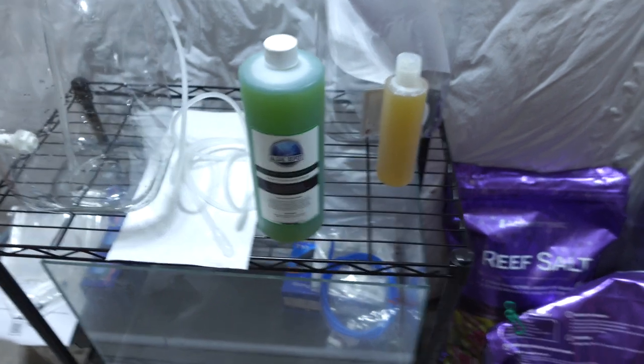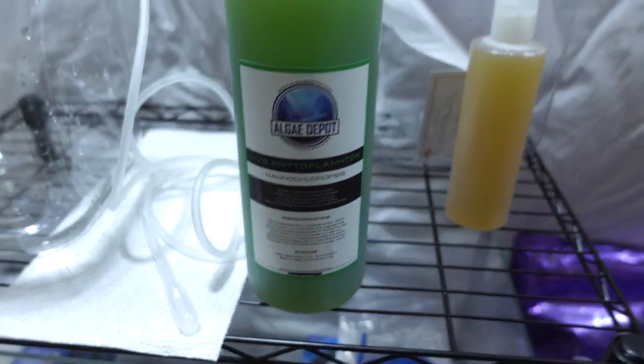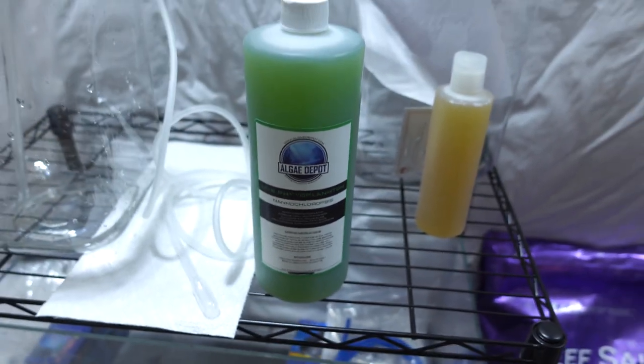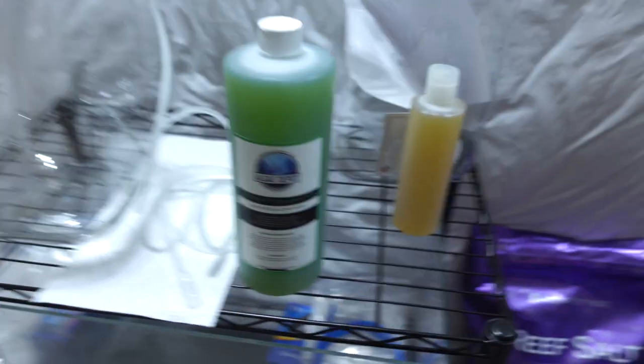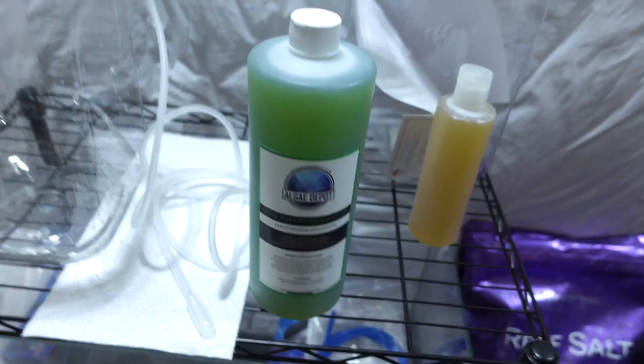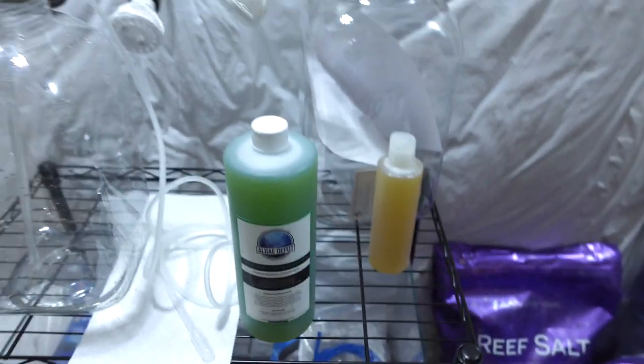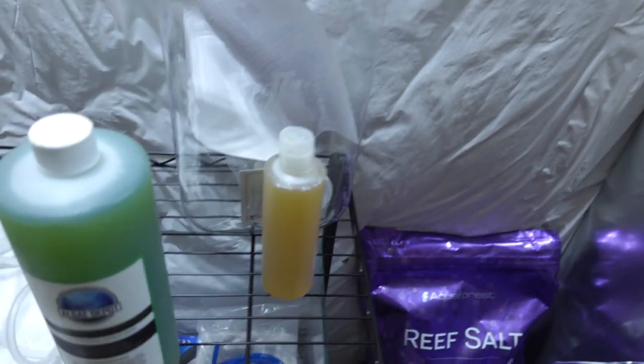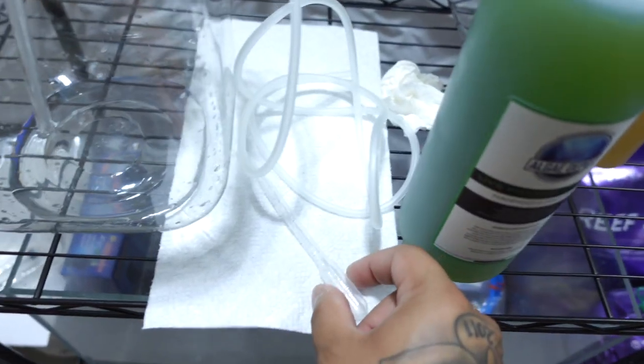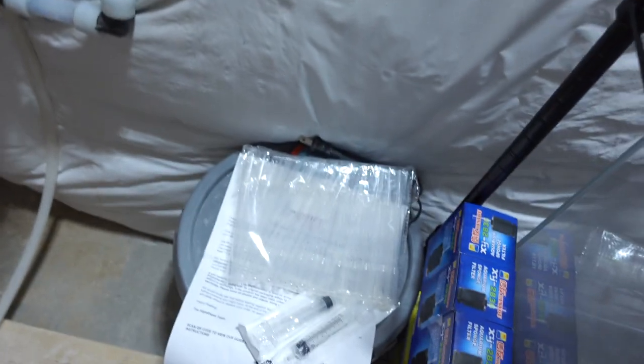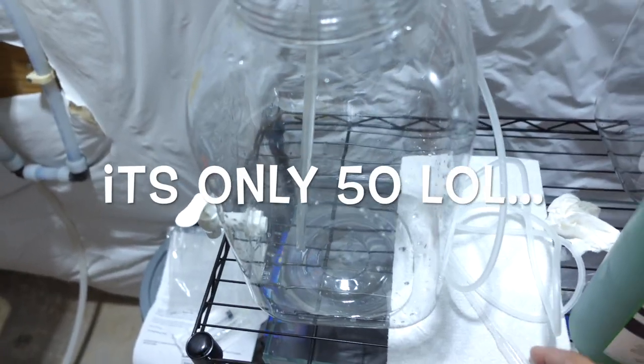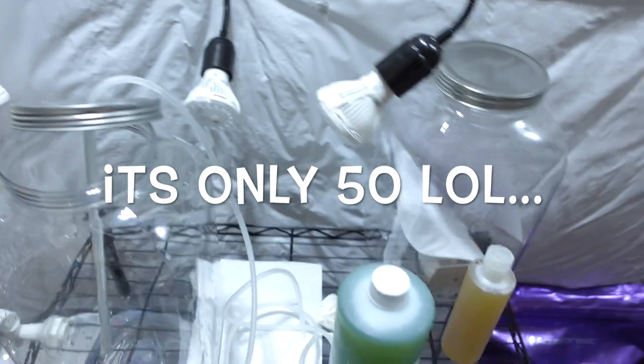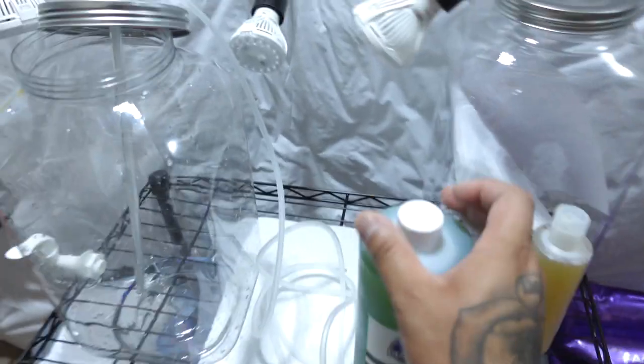So here we have the live phytoplankton doing some nano chloropsis, just some nano. And then on this right side here, we have our F2. I already took out my sanitized pipette out of that container that I have, like a couple hundred. I forgot exactly how many, but yeah, let me open this phyto here.